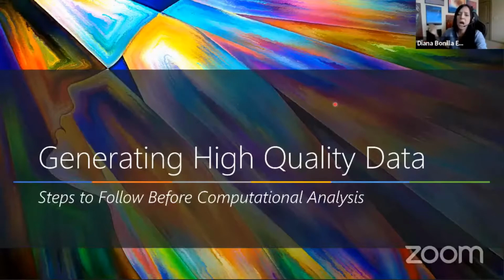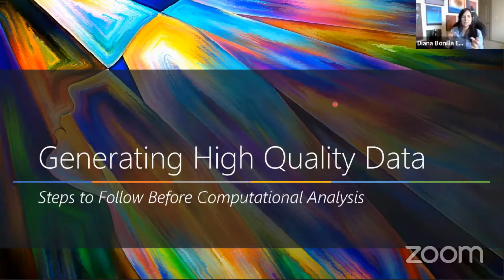So the big question is how to make sure you have good data. So the first critical consideration or something to remember is that high quality data means that all your populations are easily resolved, especially populations with dim expression, rare subsets. So at least for fluorescence cytometry, you want to make sure the photons that are emitted by your fluorochromes, your fluorescent proteins, are efficiently captured and also resolved from noise from the background. So first is that you need to have a cytometer that allows you to resolve well your different populations.